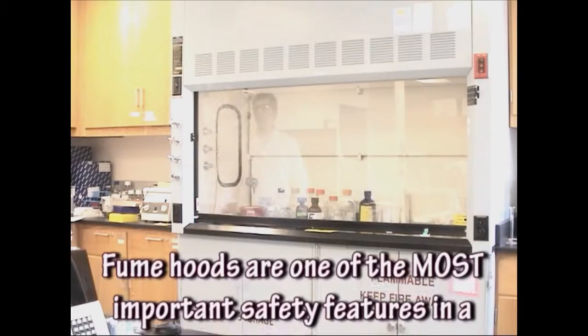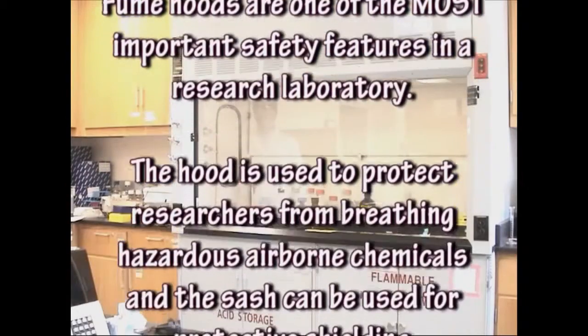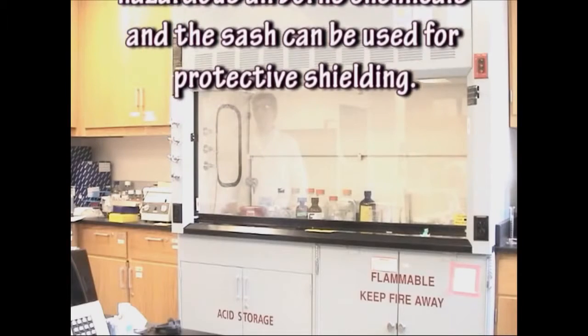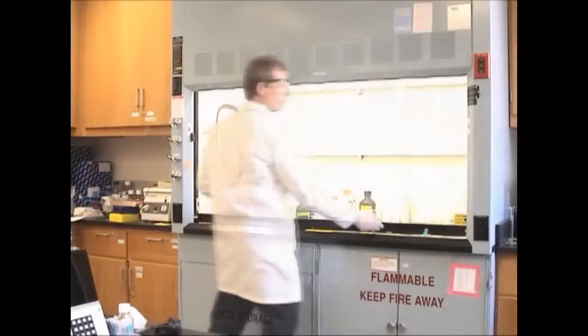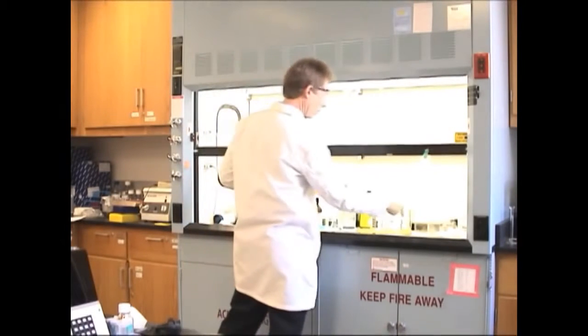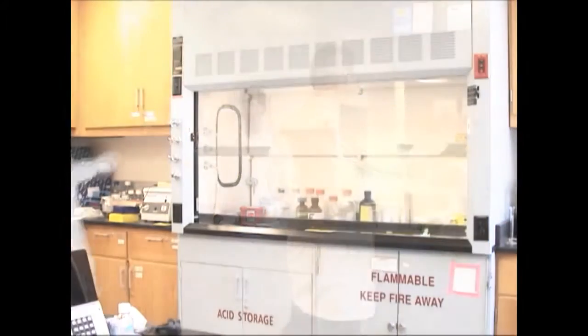Fume hoods are one of the most important safety features in a research laboratory. The hood is used to protect researchers from breathing hazardous airborne chemicals, and the sash can be used for protective shielding. This presentation demonstrates how to use your fume hood properly to better protect yourself and our environment from exposure to hazardous materials.